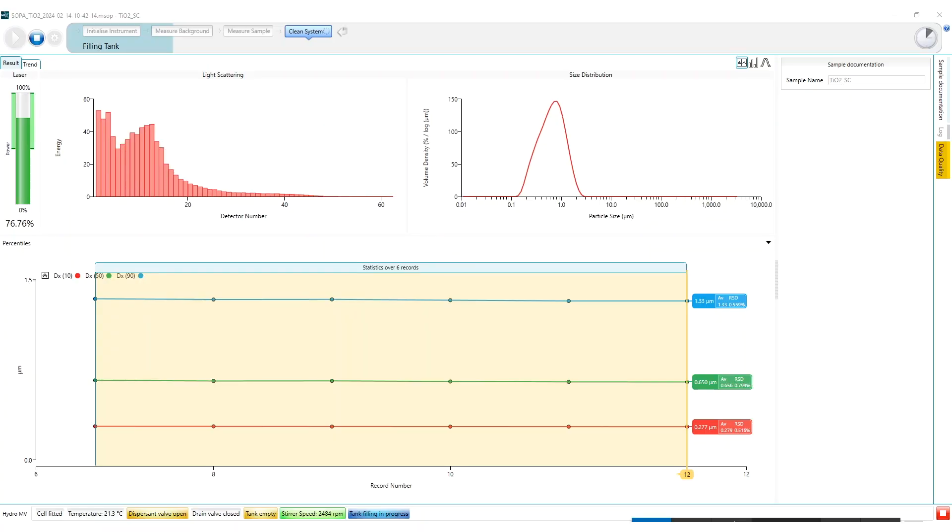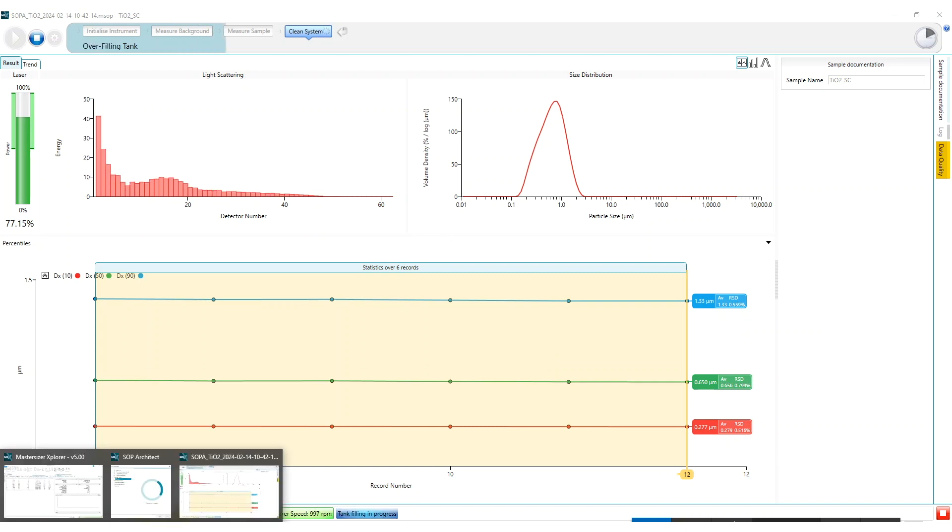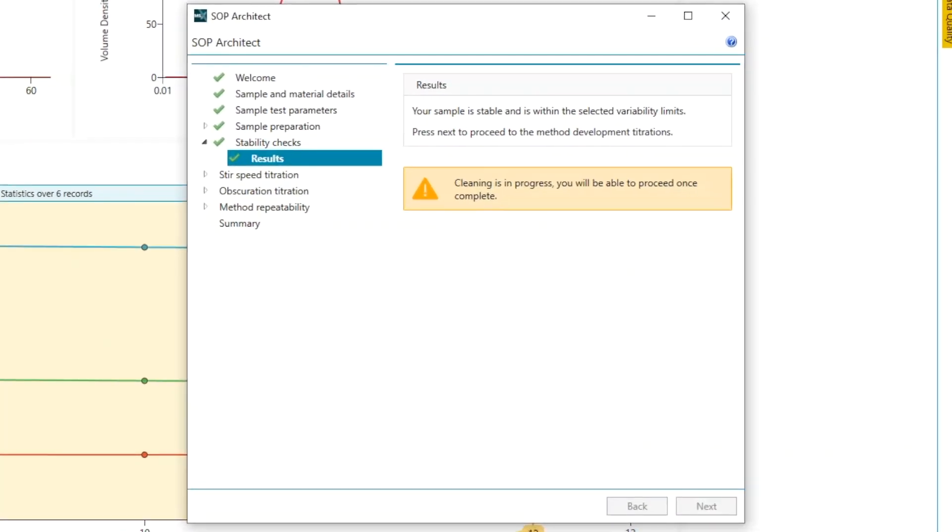So now that we've finished our six measurements we can see that we have a very stable dispersion and we can now consult the SOP Architect window to see how we proceed. We can see that the SOP Architect software feature has now advised us that we've passed the stability check and can proceed.